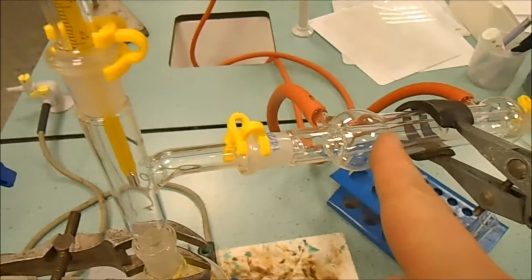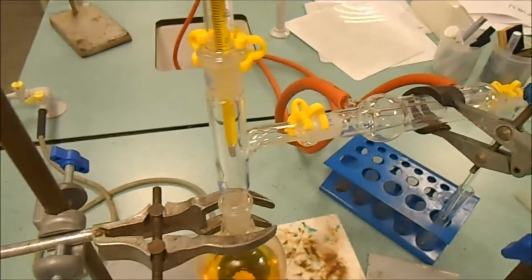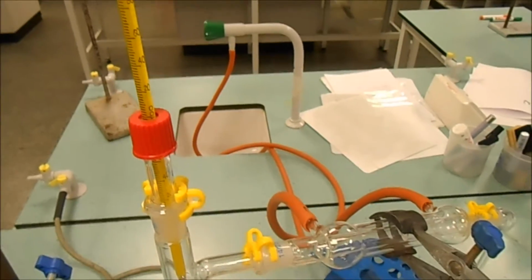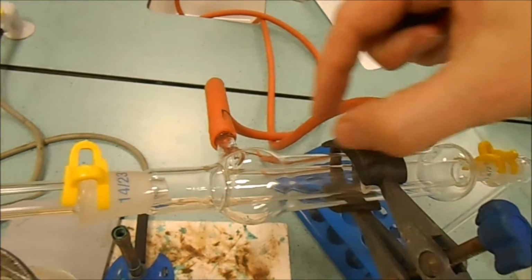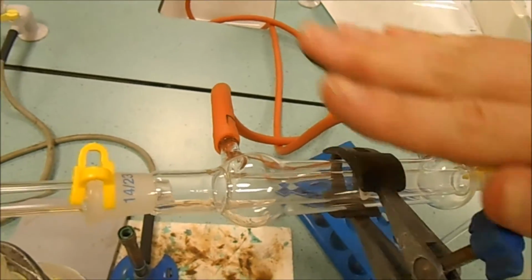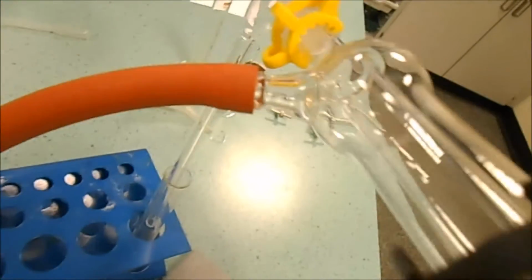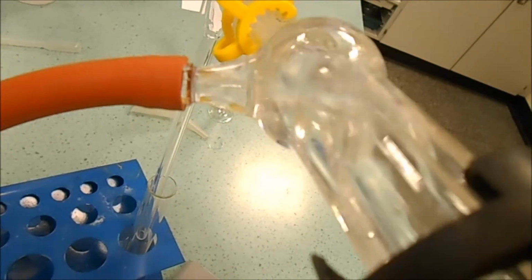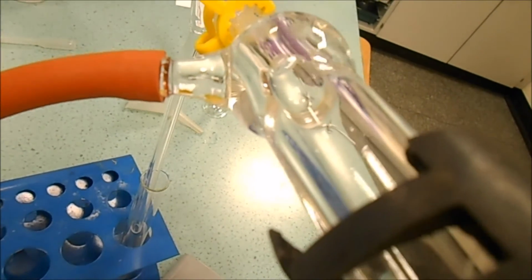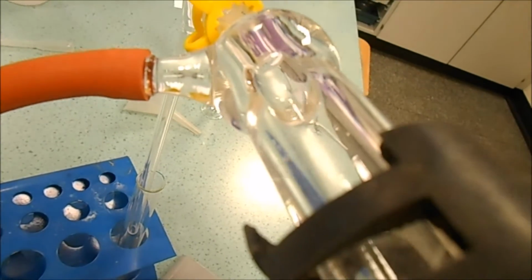Now to cool things down here, I'm going to need to attach to the water tap, which I've already done in the background there. Now the one which is attached to the water tap is the one in the bottom, so that down here, so that the water can flow upwards, and it will fill the entire condenser. So we'll just turn that on, and you will see in the condenser from the bottom water, and the idea is to try and get rid of all of the bubbles and just have water in the condenser.